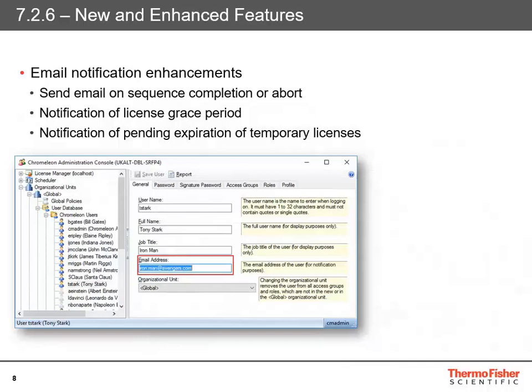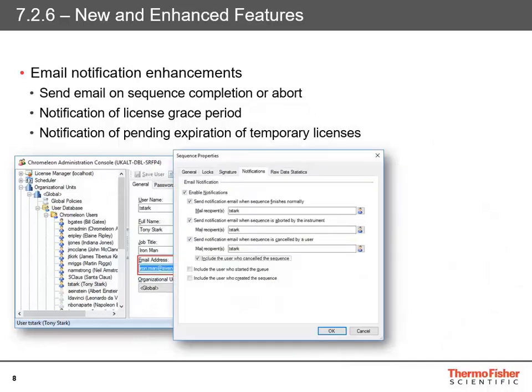Another big and really nice enhancement added is email notifications. With 7.2.6, you can now get email notifications when a sequence finishes, is aborted, or is cancelled. Each user now needs an email address added in user management. In the sequence settings you can set up when to send a notification and who to send it to. You can also include the user who started the sequence in case it's aborted by someone else — even if the user who created the sequence is not the same person who starts it.